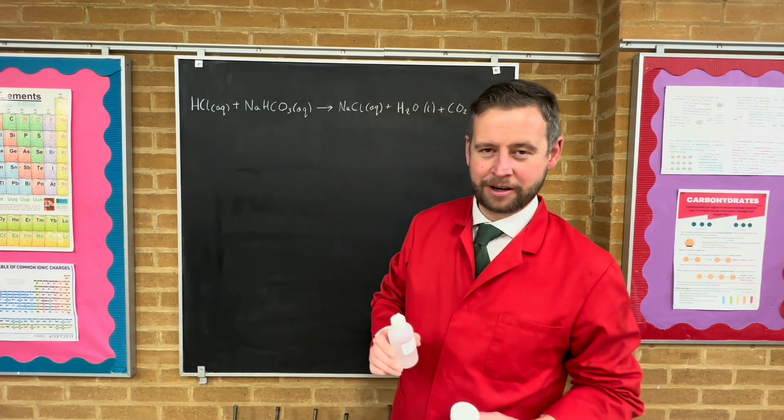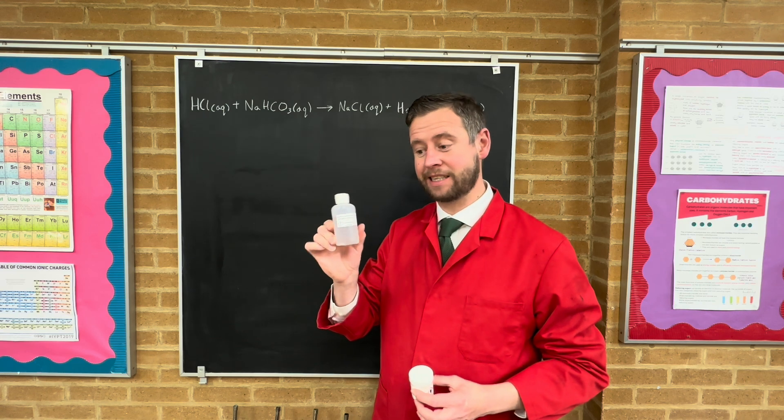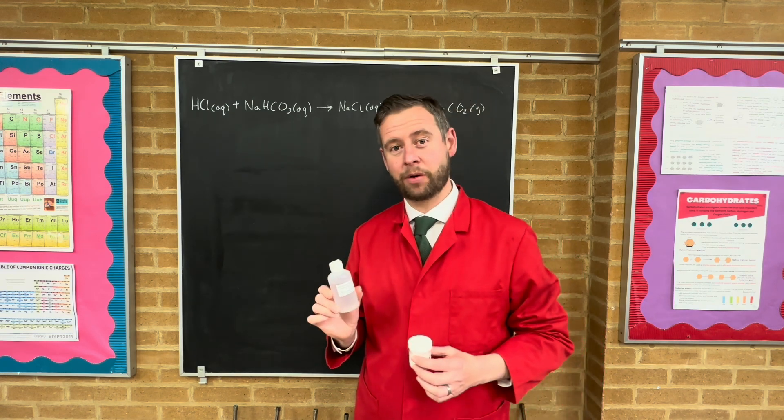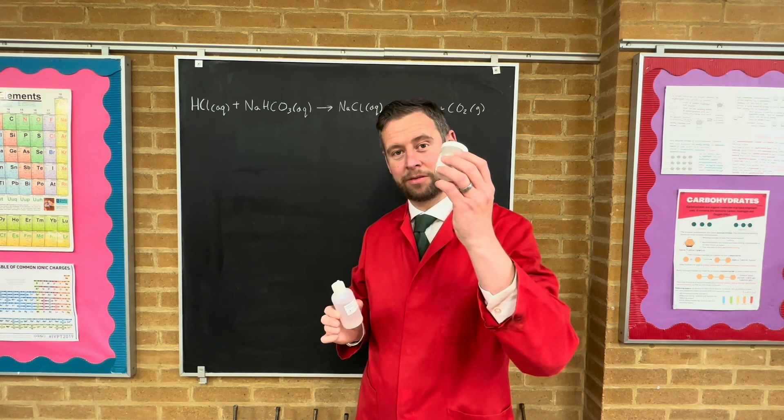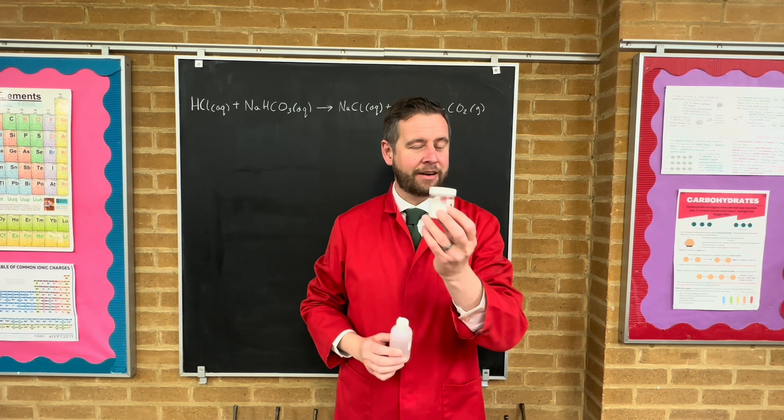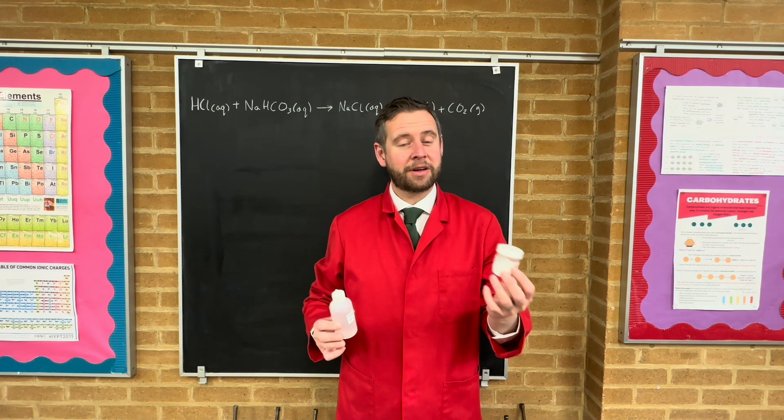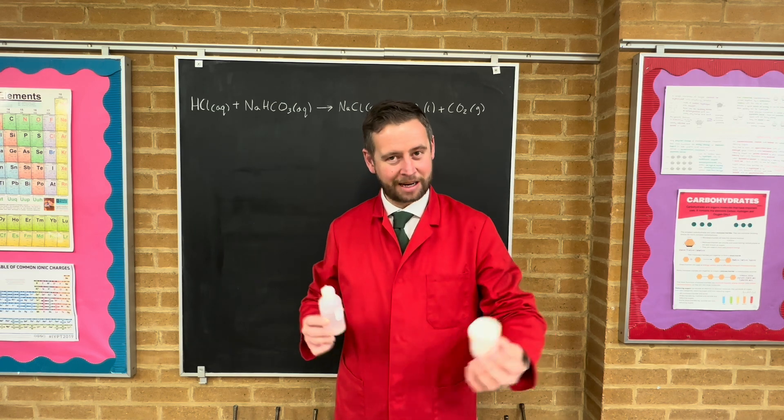For our next practical, we are going to identify the concentration of this hydrochloric acid, which is unknown at this point, by doing a neutralization reaction with sodium hydrocarbonate. We're going to make a standard solution of known concentration and then make that the analyte of the titration. Let's do this one step at a time.